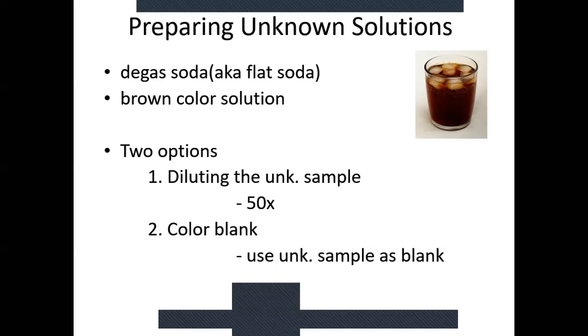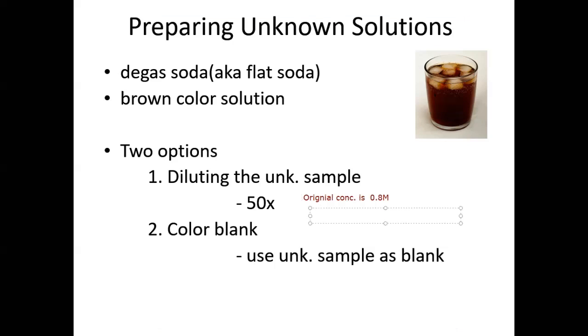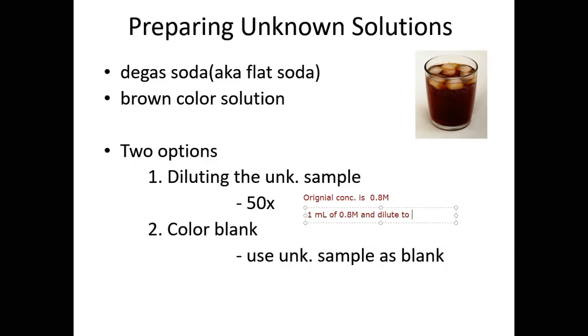So for example, if the original concentration is, say, 0.8 molar, we take 1 milliliter of 0.8 molar and dilute it to 50 milliliters. This is a 50-fold dilution.